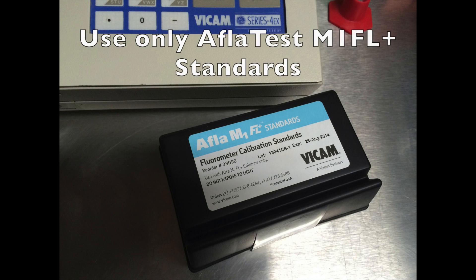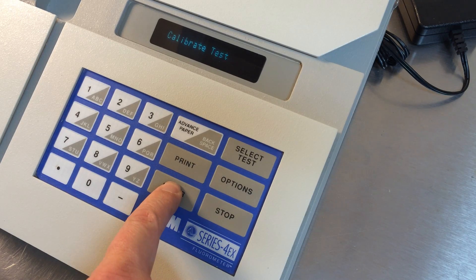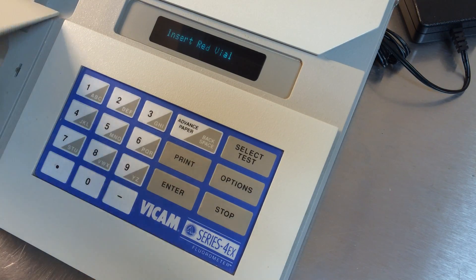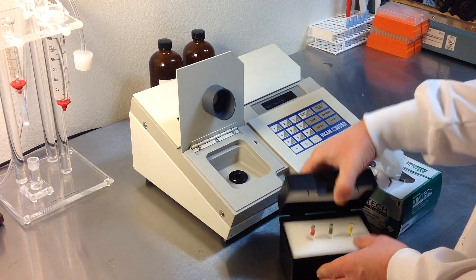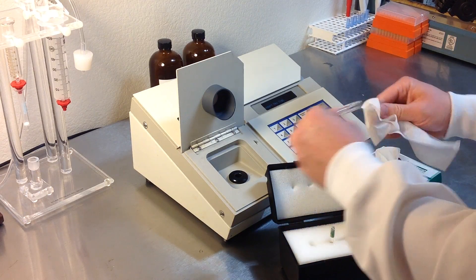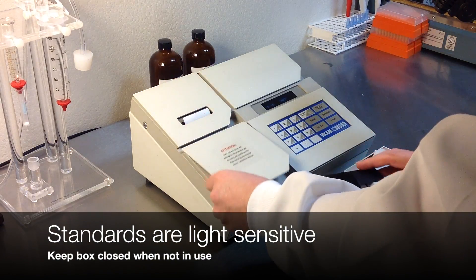To calibrate, use only the AFLA M1 FL Plus standards. Turn on the machine and press Options. Press Enter to choose Calibrate Test. Press Select Test until you see AFLA M1 FL Plus. The machine will prompt you to insert the red vial. The standards are light sensitive, so keep the box closed between use.